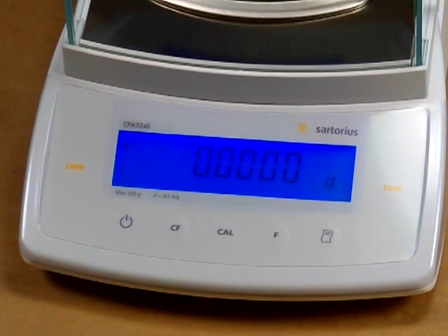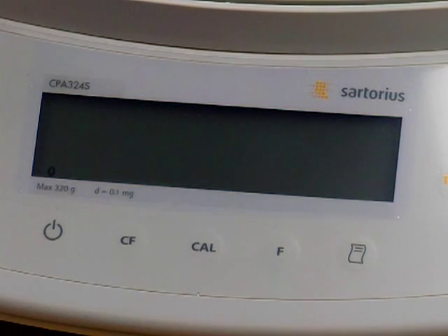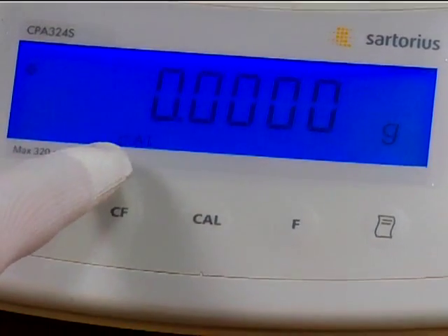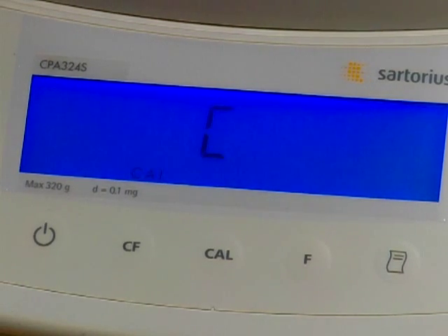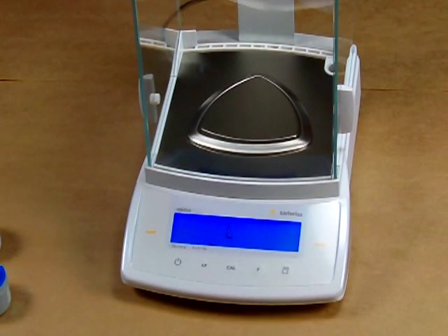Now the balance is set for motorized internal calibration. Shut off the balance, then turn it back on and press the Cal key — you'll notice it says Cal on the bottom. Now all we have to do to match the calibration is press the Cal button. It will say C and then CC, and what the balance has now done is stored the value of the internal weights to match those external weights we had just recently placed on the platform.